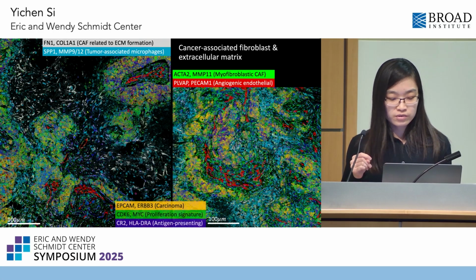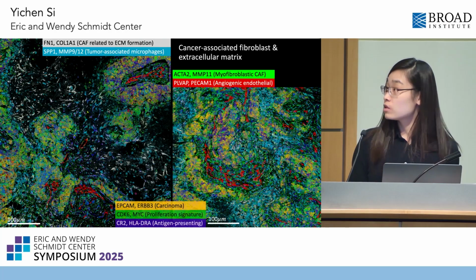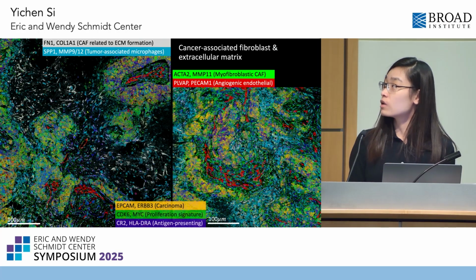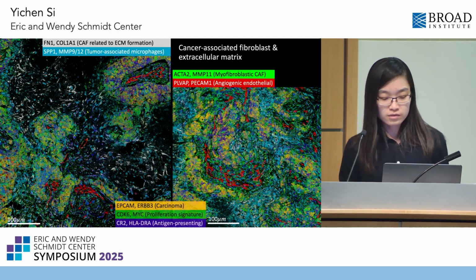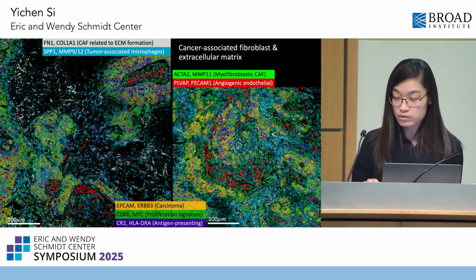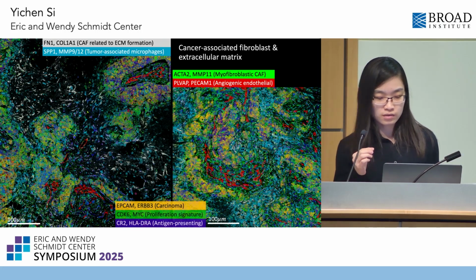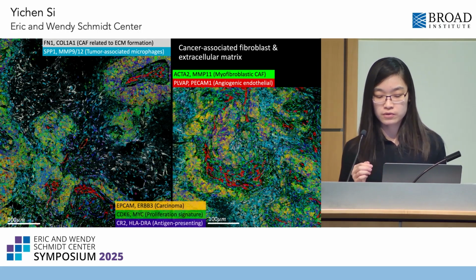They are in a region also rich in tumor-associated macrophages. On the right, we see the co-localization of these two factors in a different context. The light green pixels, with a similar fiber-like structure, are also cancer-associated fibroblasts, but with a different functional signature.